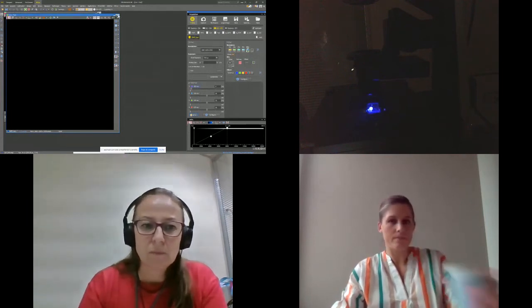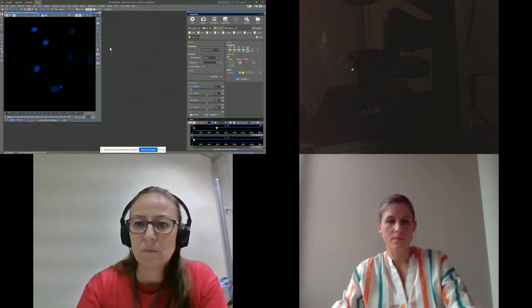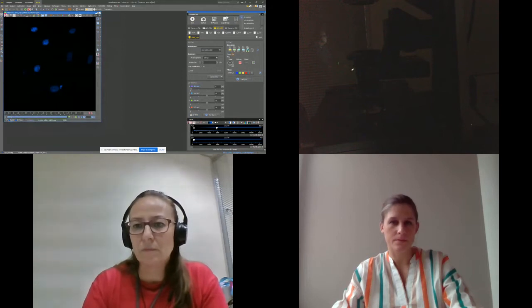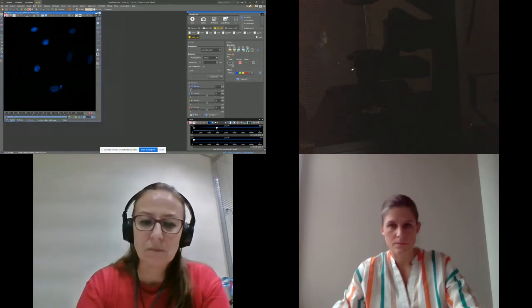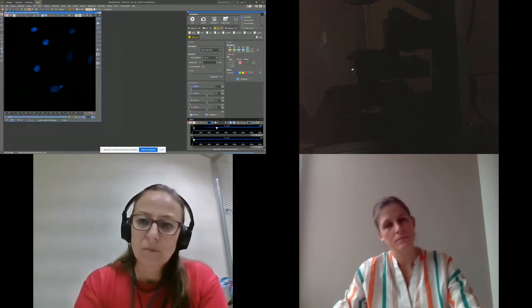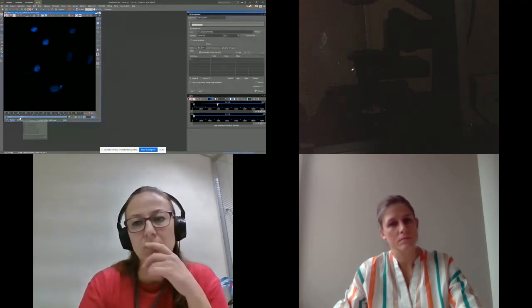I'm going to very briefly show what I did this morning. This morning, I set up an ND acquisition. In this ND acquisition, I simply added these two optical configurations, DAPI and DAPI low. I clicked the two for several XY positions, which are these positions that we have in here. I think I did it for 15 positions.